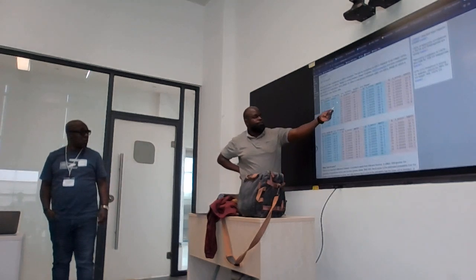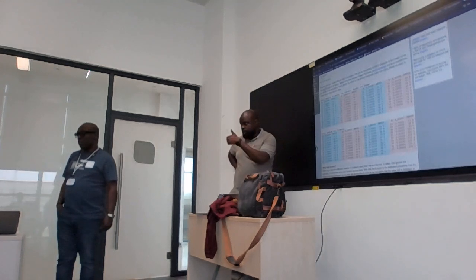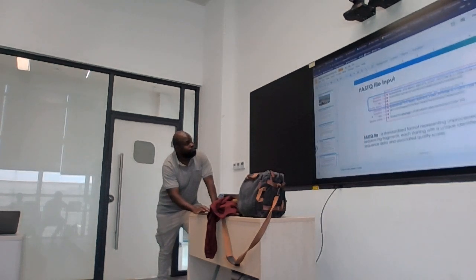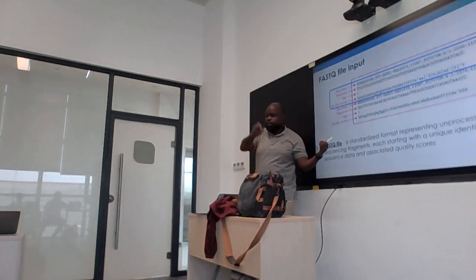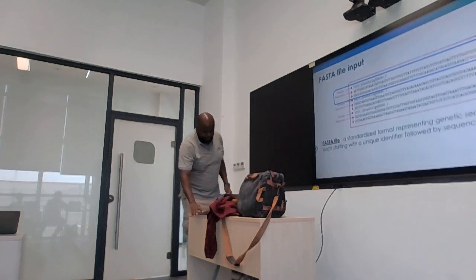And you can see that, you know, different characters here have different quality scores. Okay? So that's why when we go back to our slide set here, if you look at this read here, each base has a value. Okay? And then you go to the next read and like that. And as usual, you expect one file to have thousands of reads. All right? Okay.